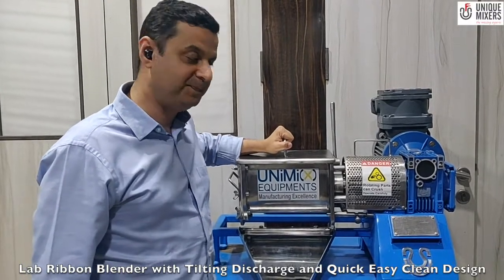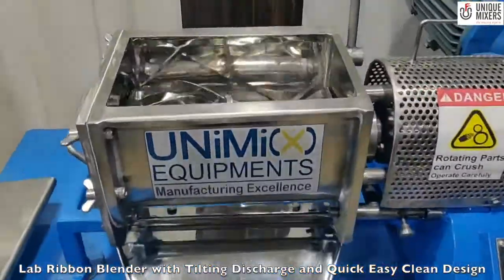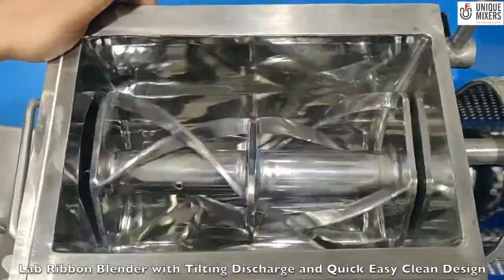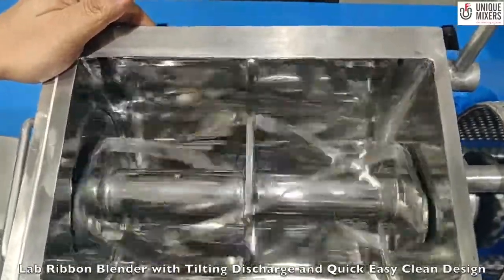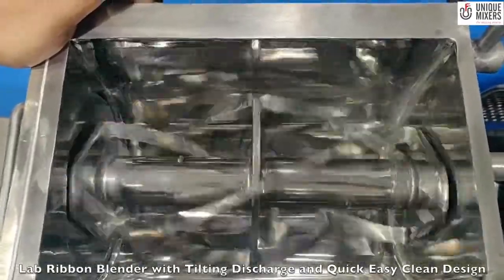Let me show you the operation of this mixer. This mixer has a safety switch. We have bypassed the safety switch so that we can show you a demonstration. What you see here is the mixer with double helical ribbon agitators. The agitators produce a counter flow which is required for good homogenous mixing.